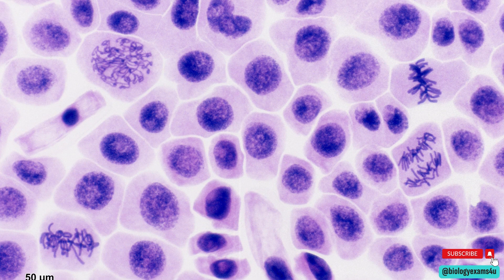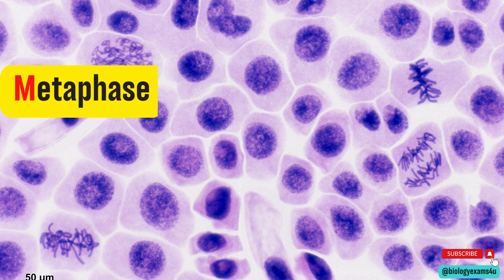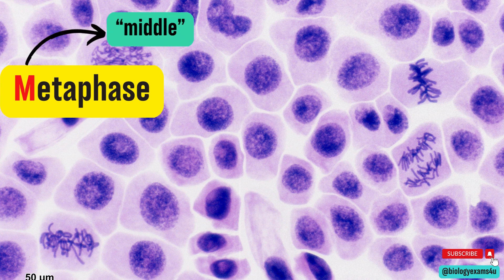Let's begin with the easy ones. The easiest stage to identify is the metaphase. Remember, M stands for middle. Now look at the cells that have chromosomes or chromosomal strands lined up in the middle or center of the cell. Here you can see that chromosomes are aligned at the center — this is called a metaphase plate.